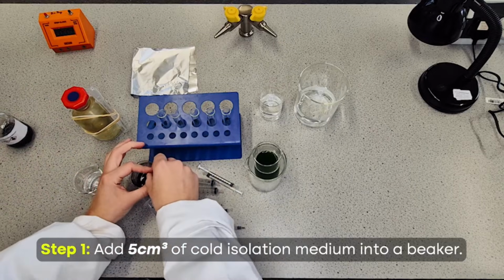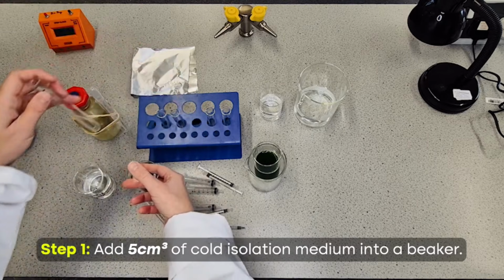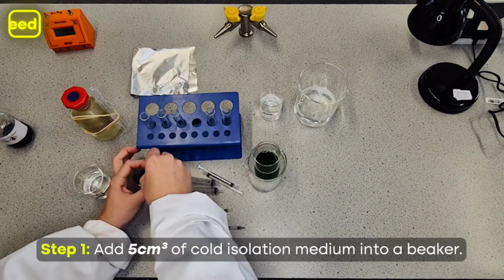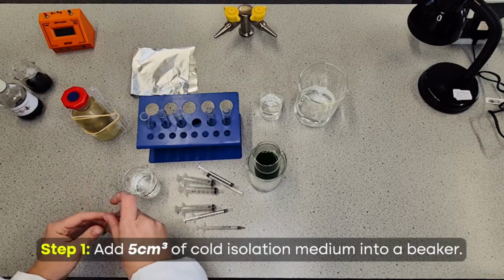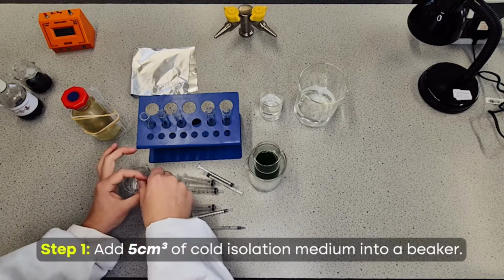We need 5 in every test tube apart from C. Let's put C out of the way for now. So the DCPIP is our redox indicator. Then distilled water, that's going in all of them apart from the last one.